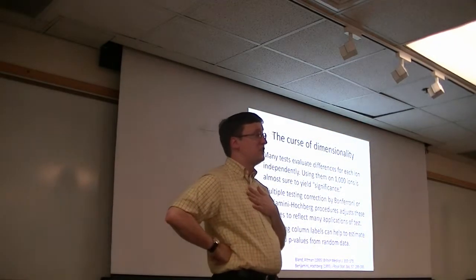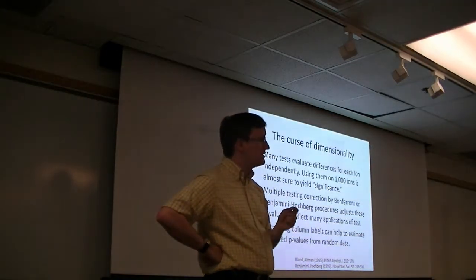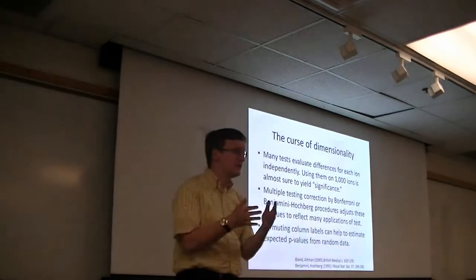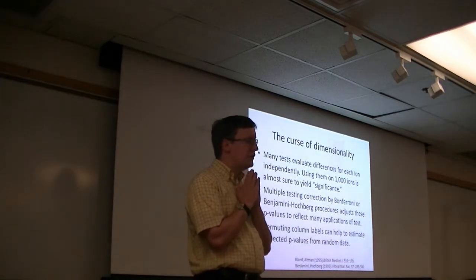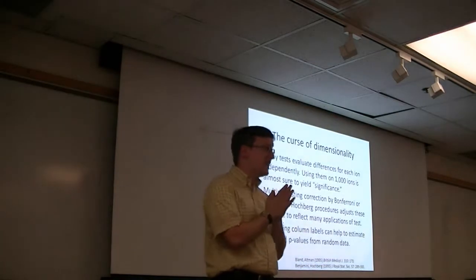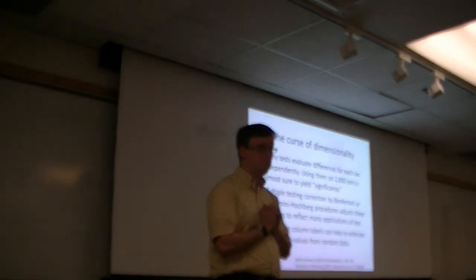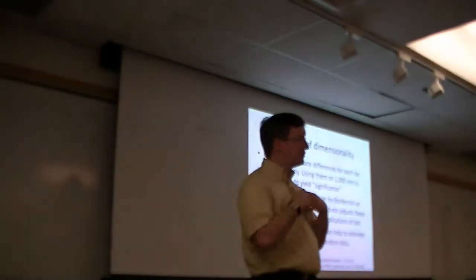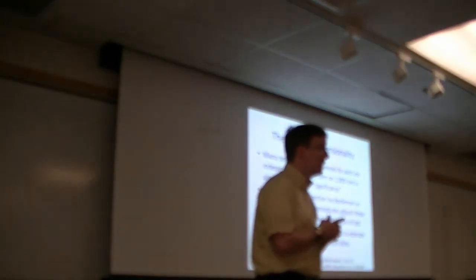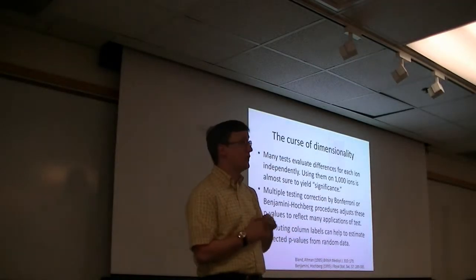So let's start with the most conservative of them. Bonferroni correction is one of the ways that we frequently see in Manhattan plots for GWAS, genome-wide association studies. The notion behind this is that if you are running 20 tests, you should be 20 times as stringent in accepting them. So if your standard for applying a p-value threshold typically is 0.05, and you're performing 20 tests, you divide 0.05 by 20 to get your new threshold.